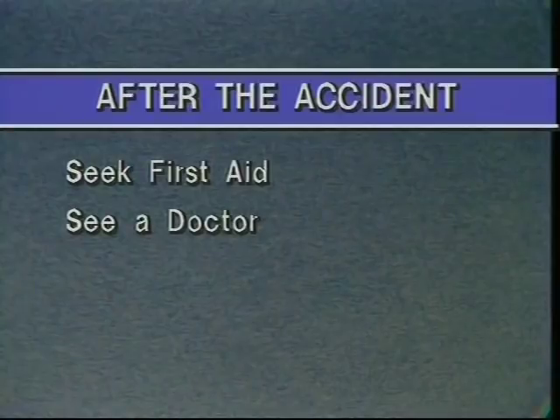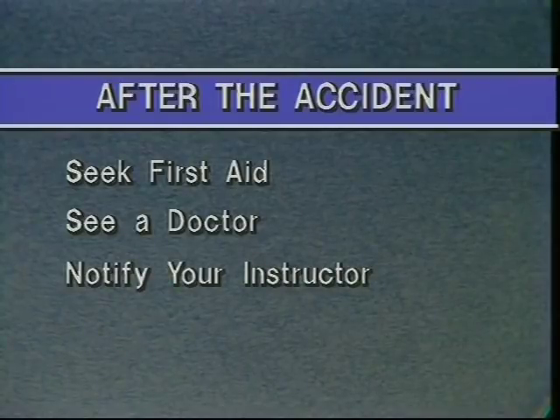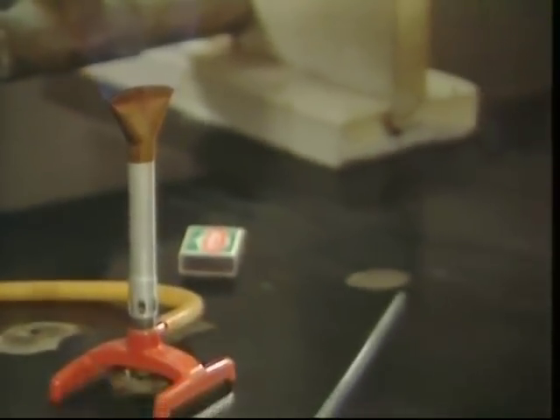Always make sure that someone goes with you to the medical facility. It's possible you could succumb to shock on the way, even if you think you're fine. Now, your instructor must be notified of all accidents, no matter how small they might seem. The most common laboratory accidents involve burns and fires.